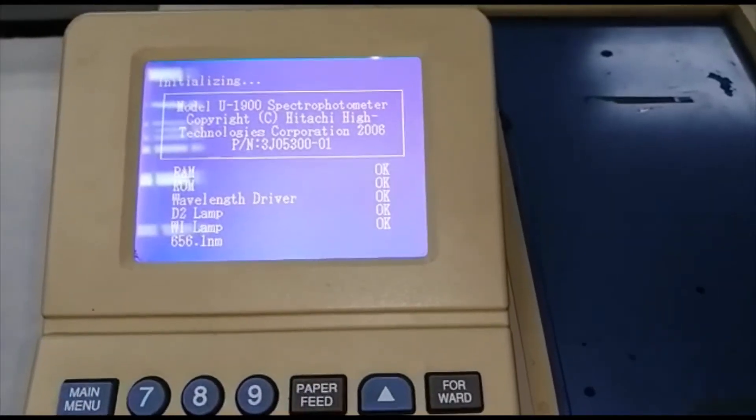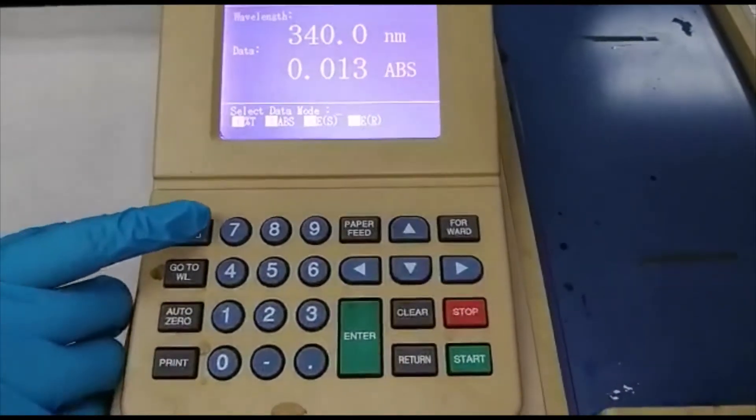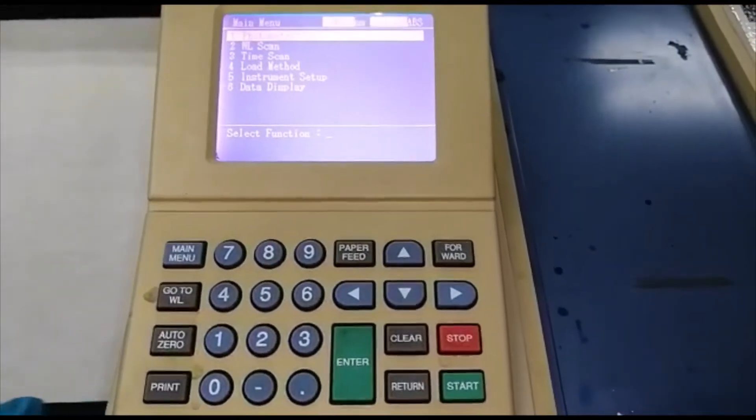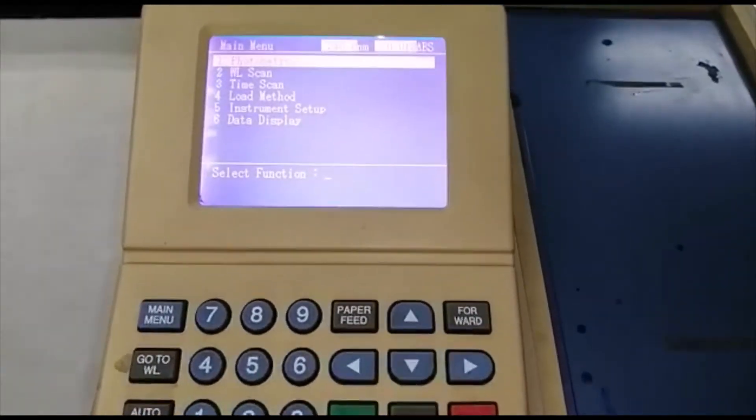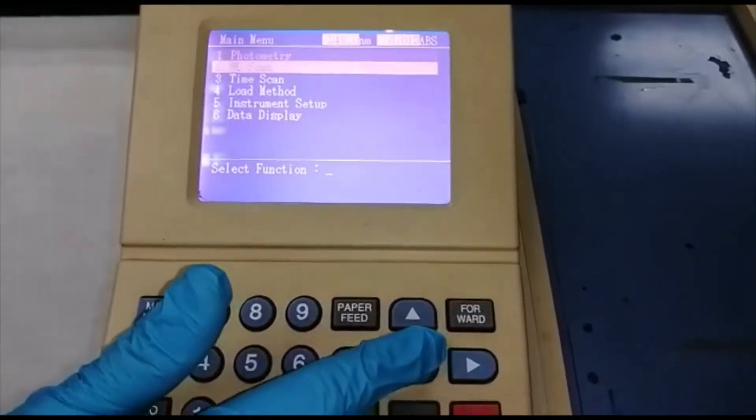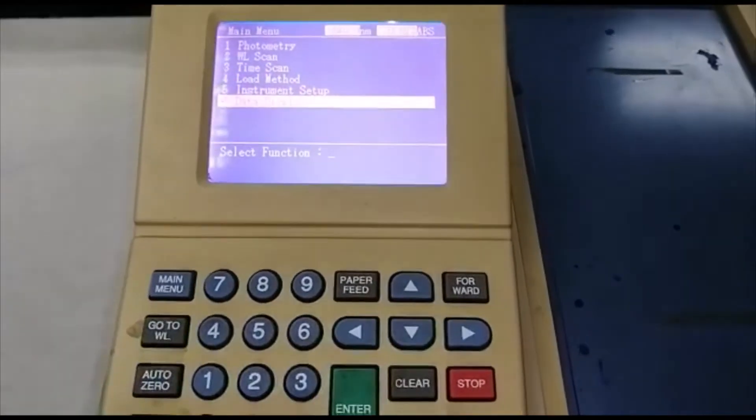Jom kita mulakan. Tekan butang main menu. Pada paparan, pilih data display dan tekan butang enter.